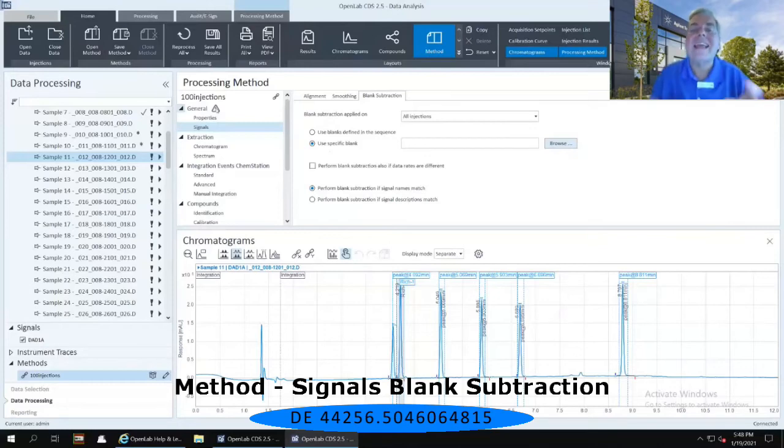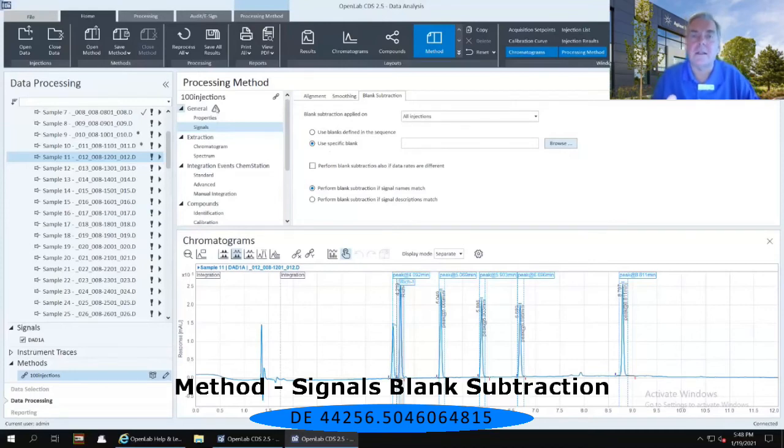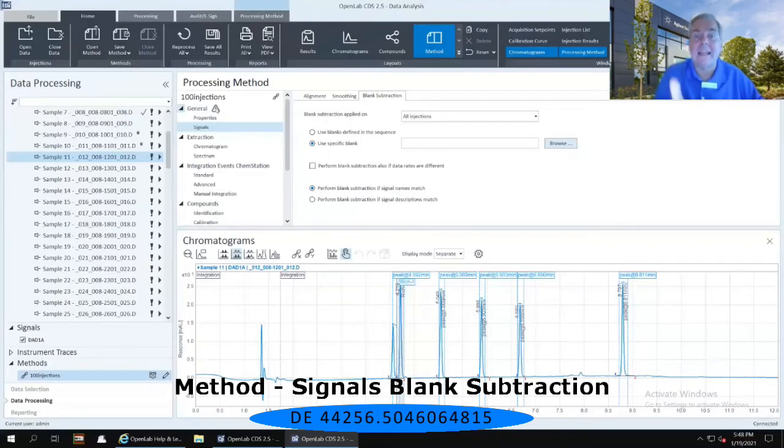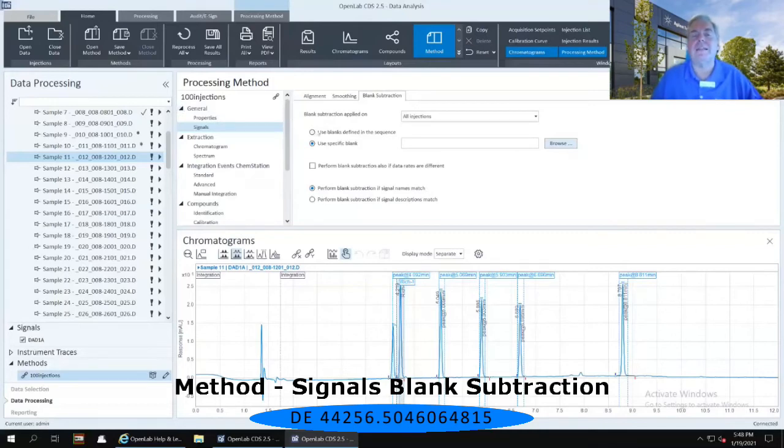So therefore, I can't use this process to subtract a specific blank from the other samples because a blank is not apparent in any of these injections. So I'm going to reselect the use blanks defined in the sequence first.